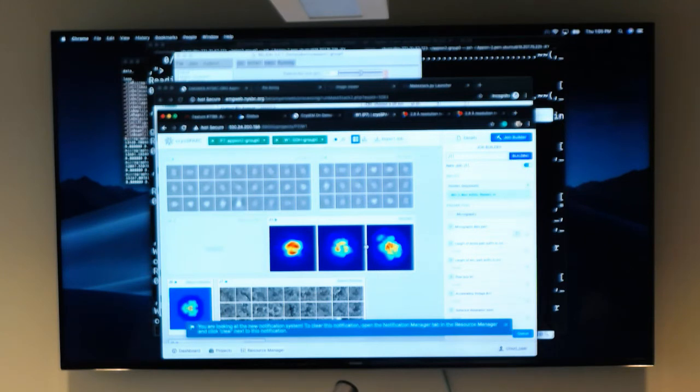This one. No, the top one. Particle. Yeah. And what are the other? This one. Run this first and see if we come into an error, and then you can always kill it. Yeah, just run default first, then we'll see if we have another error.